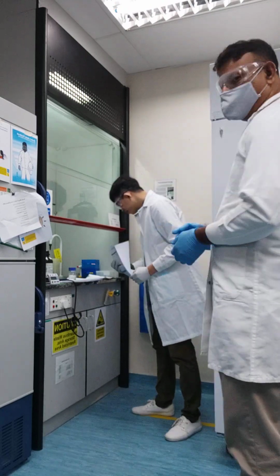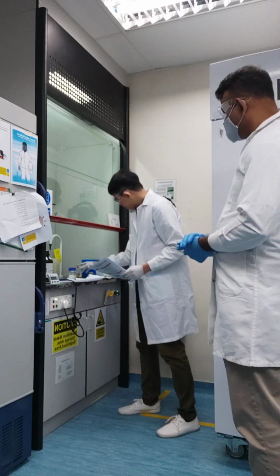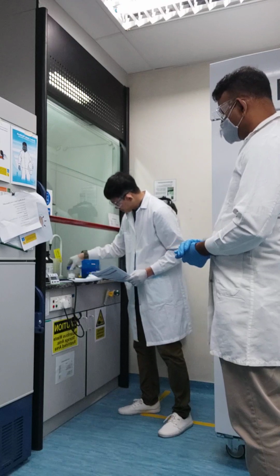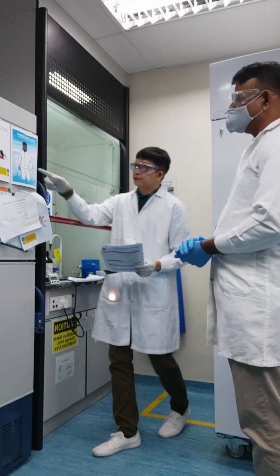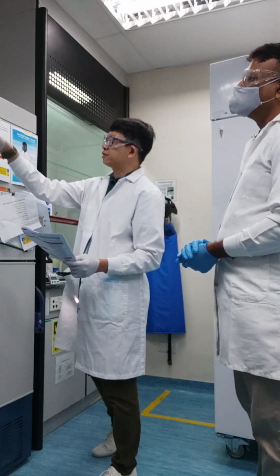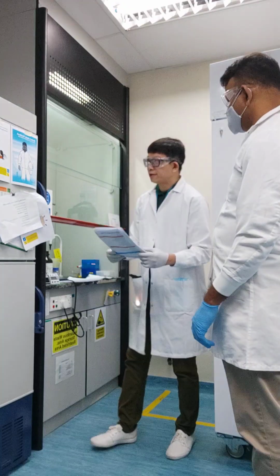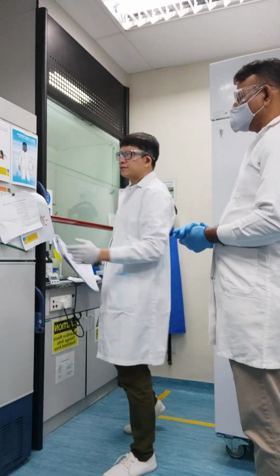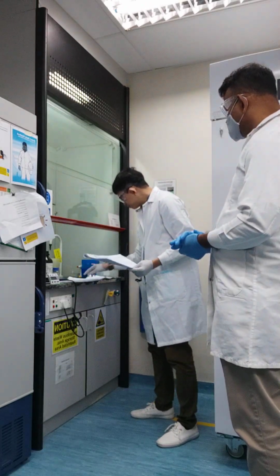Then the next step is I need to look at the symbol. So in both portals they have a symbol pasted, and I refer back to here. This symbol stands for corrosive. This symbol stands for irritant. Excellent. So now I know all the safety information and recognize the physical hazard. So I'm at step 3.